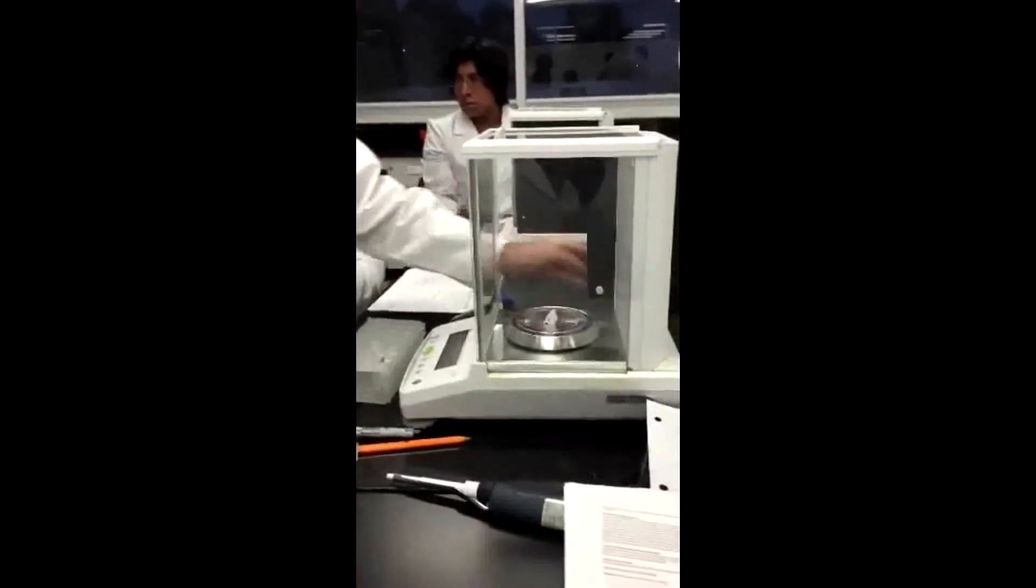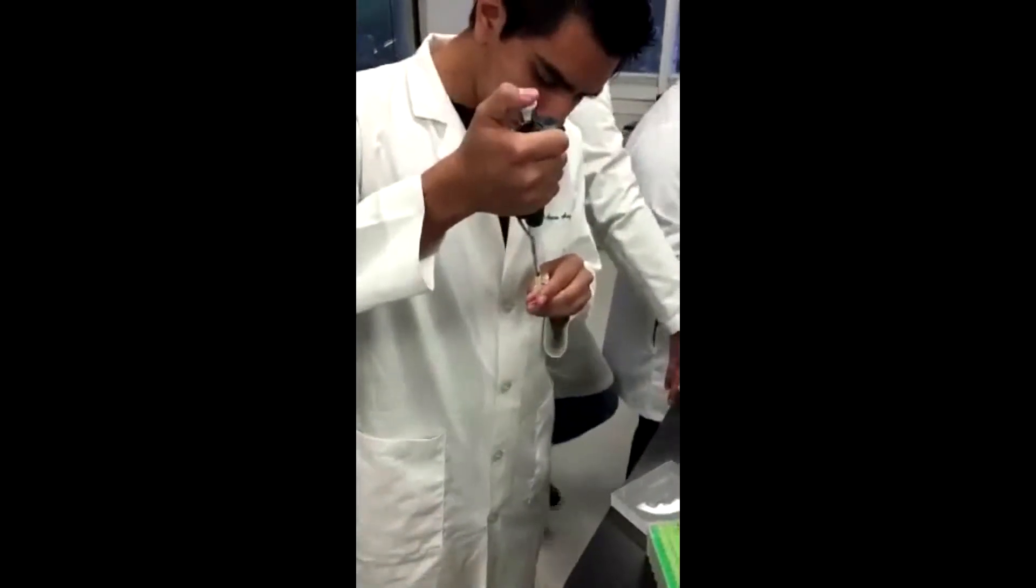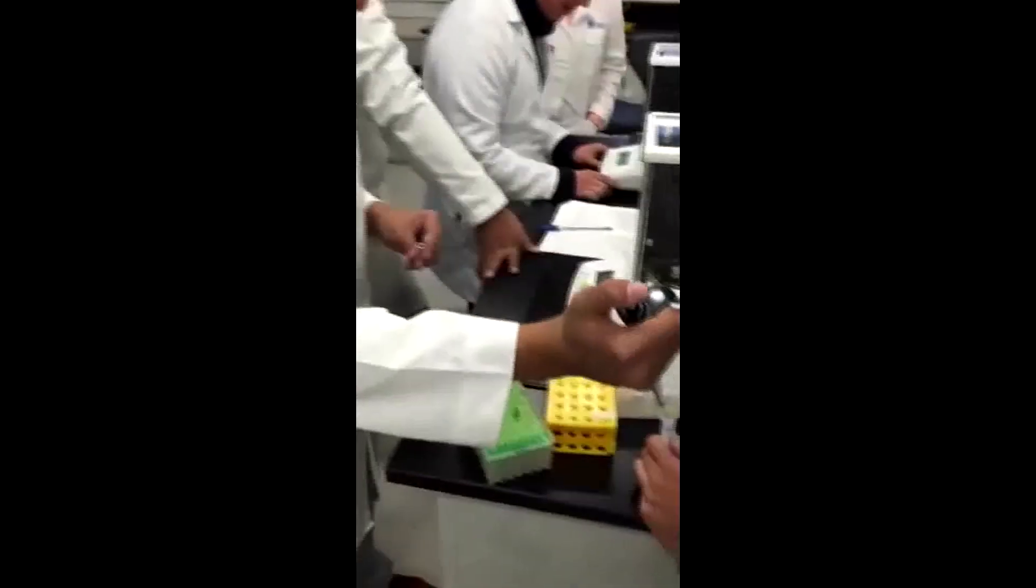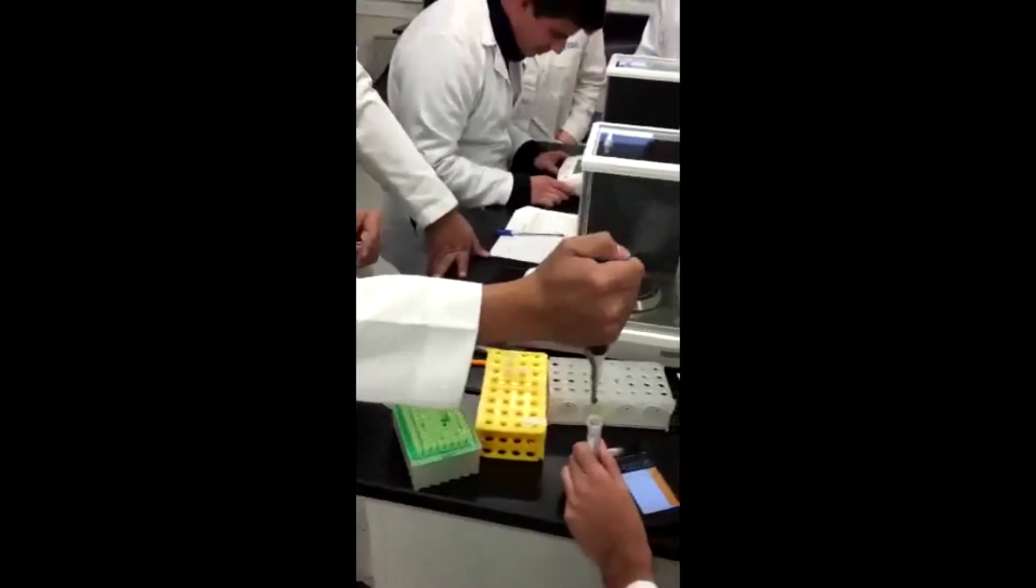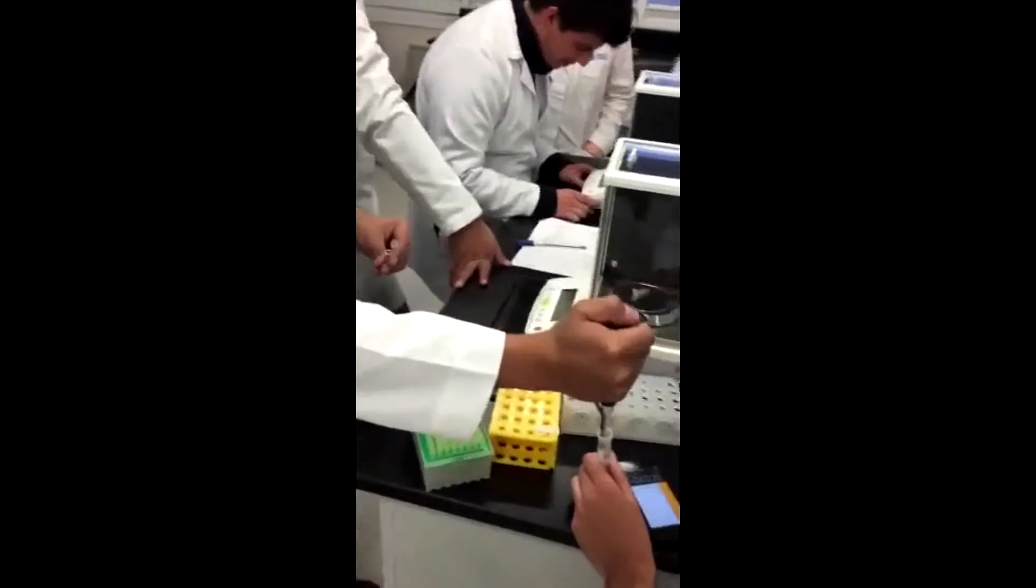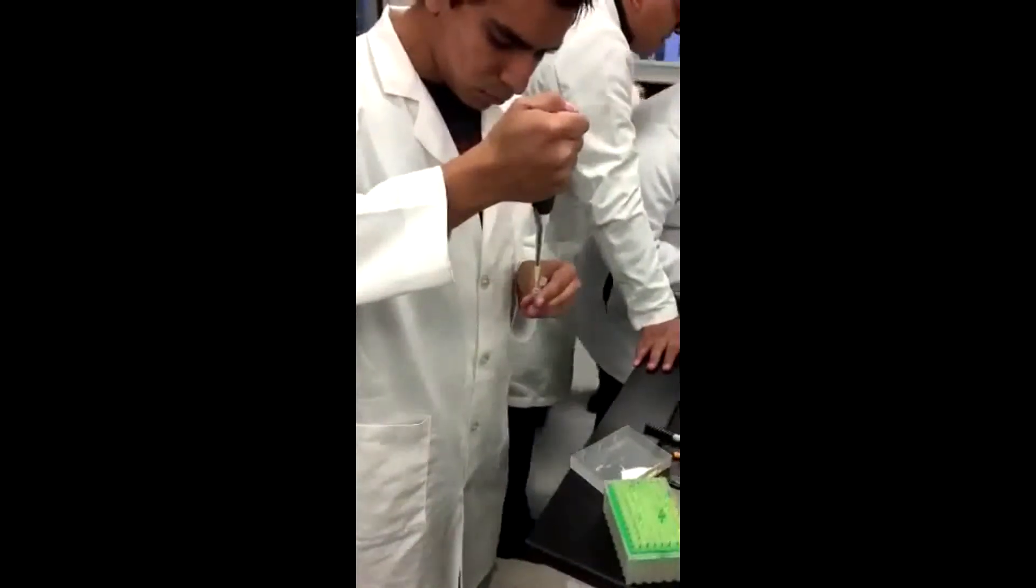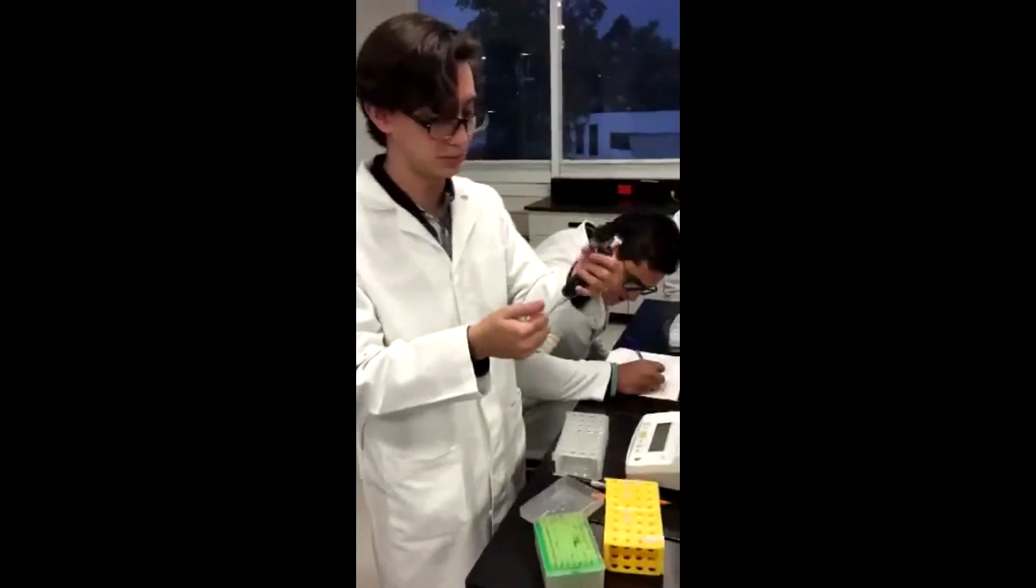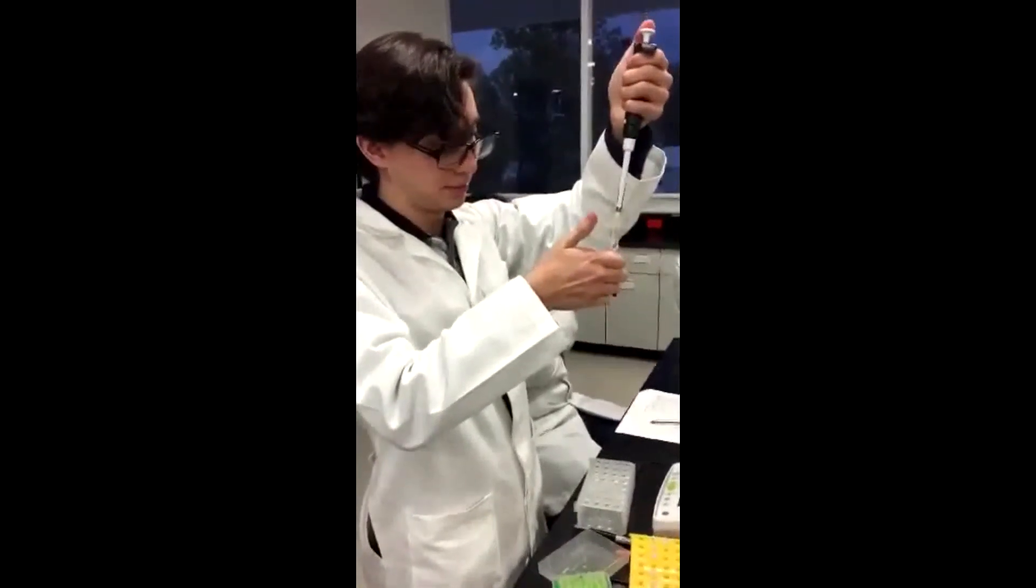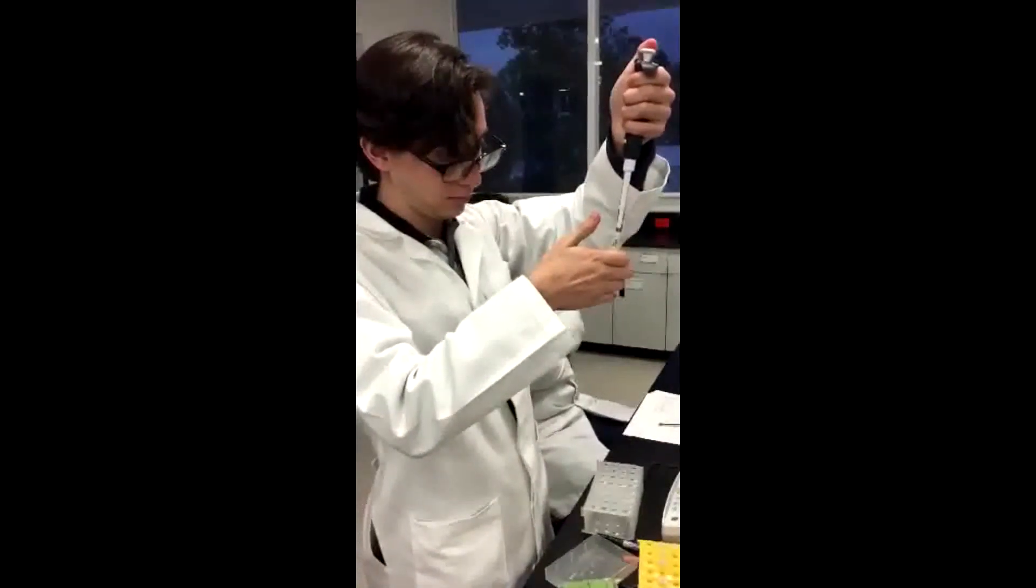In the second part of the experiment, we took a micropipet from 2 microliters, another from 200 microliters, and another of 1000 microliters, and we took five samples of every micropipet. Then, we calculated an average and a standard deviation to discuss the results.